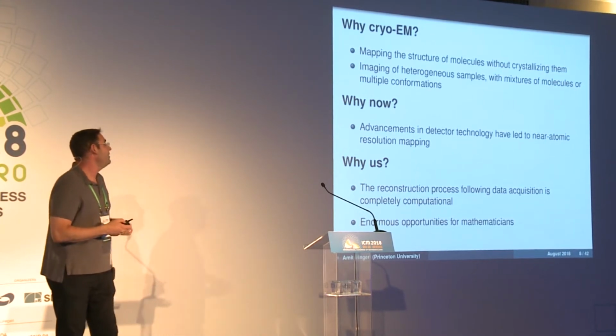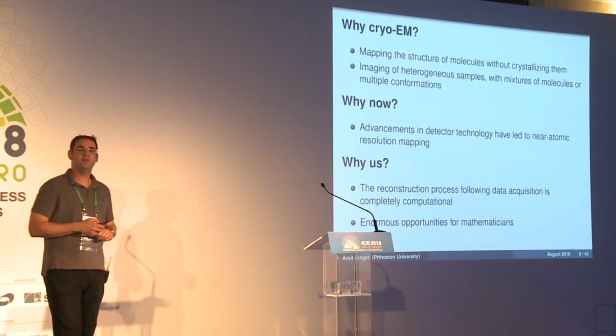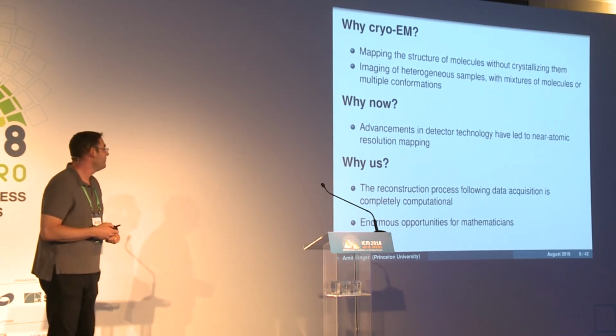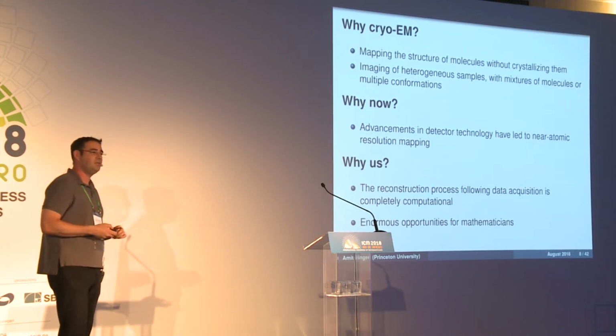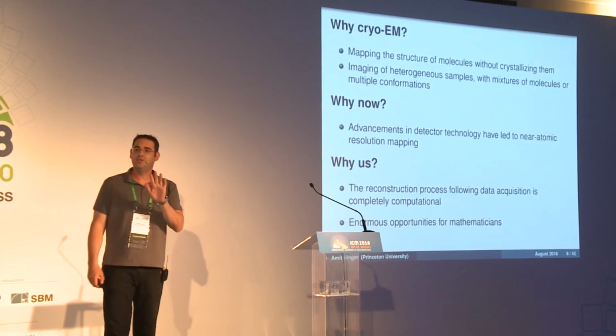So why cryo-EM? As I mentioned, it's a method that allows us to get molecule structure at near atomic resolution without crystallizing the molecules. So it's a very general technique. And it has another major advantage: it images single molecules.